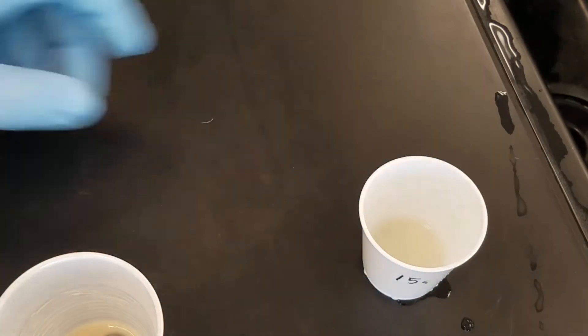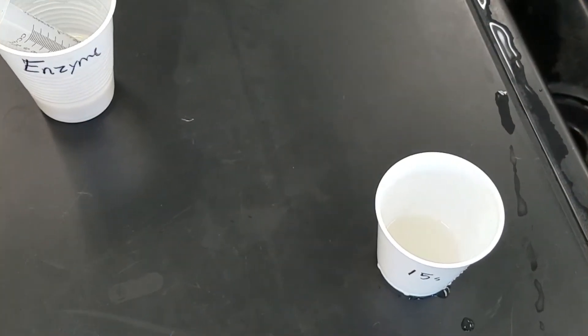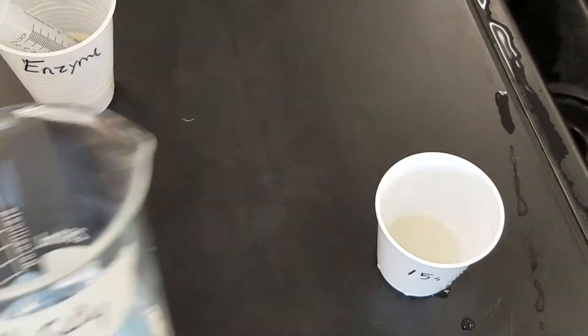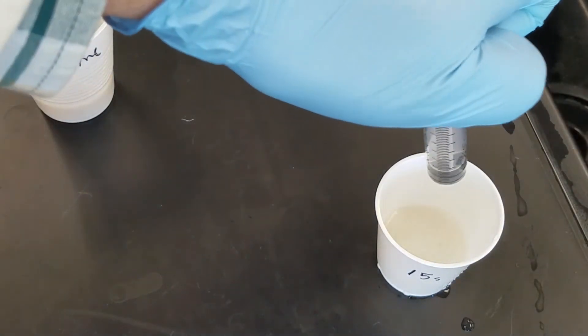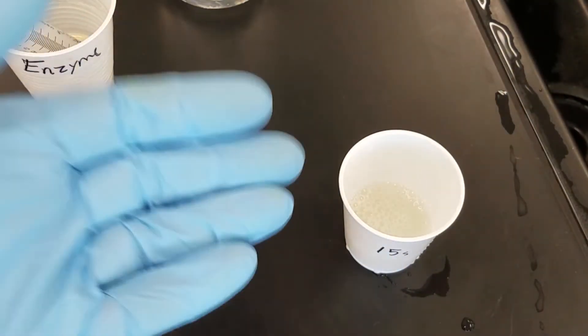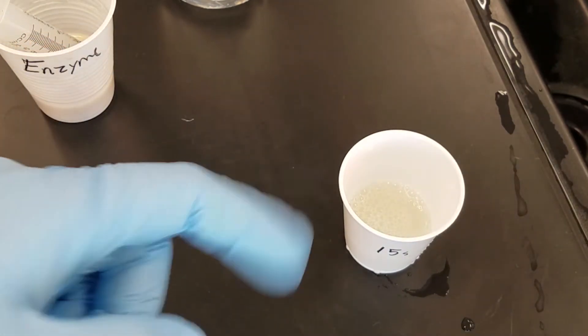Good idea to give it a little swirl. After 15 seconds has passed, you're going to add 10 milliliters of sulfuric acid and squirt it in just like that. Make sure you give it a little swish. The enzyme is denatured. The reaction has stopped.